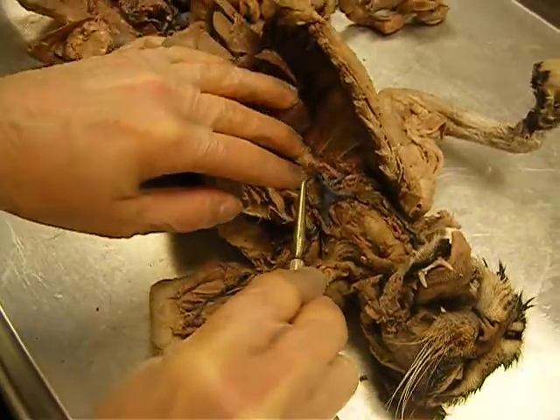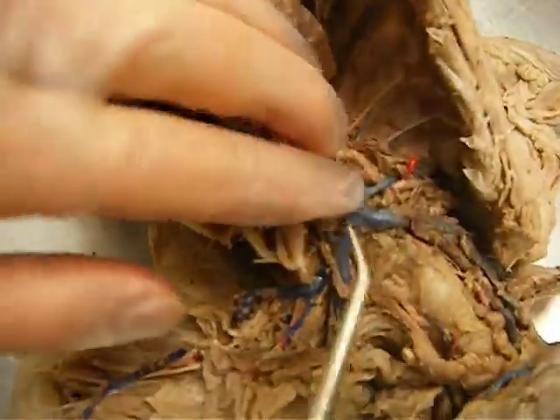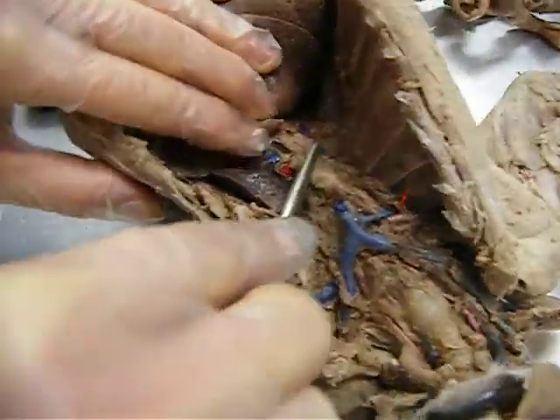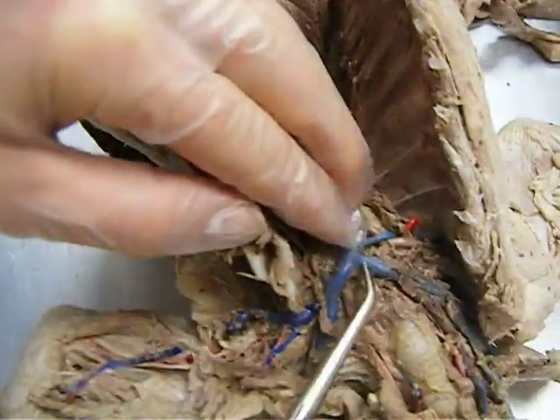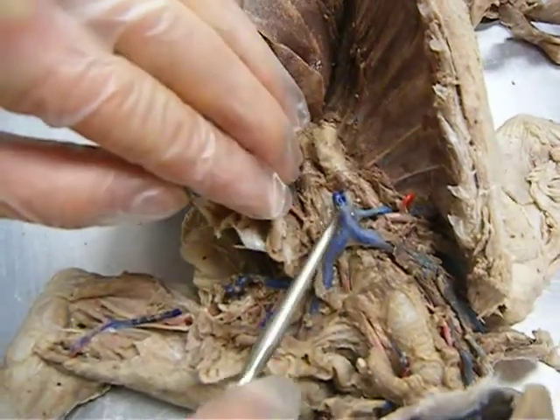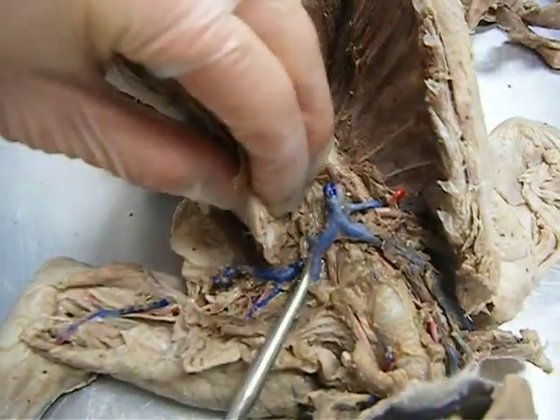From the heart is the superior vena cava. We'll follow the veins first. This is the costocervical. Underneath the lungs is the azygos vein. This branching right here is called subclavian. Dumps right into the brachiocephalic.